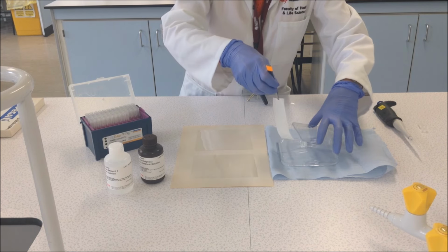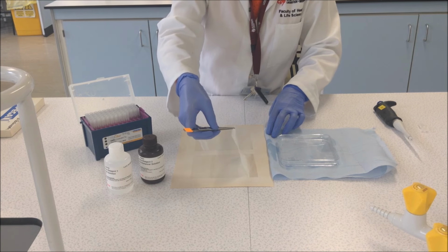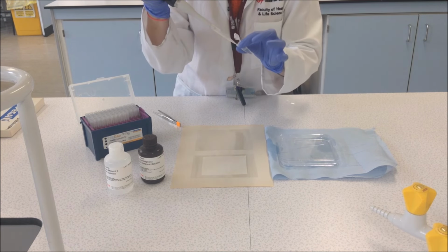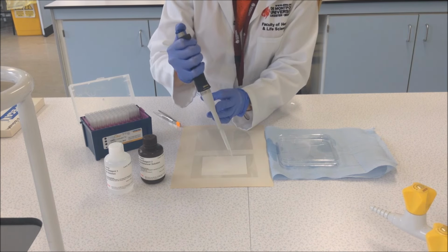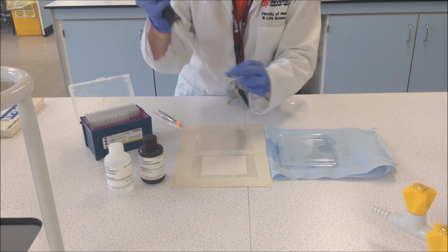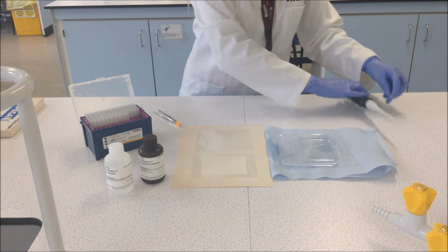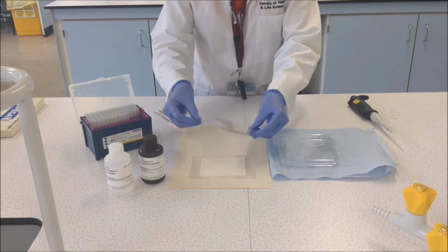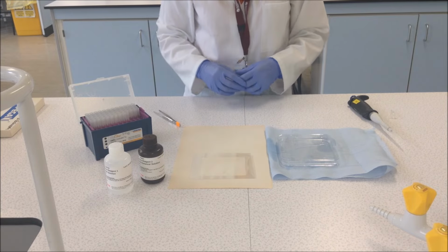What you then want to do is take your nitrocellulose membrane and place it onto a sheet of acetate. Then, using the solution of the combined detection reagents, carefully inject a layer of this over your nitrocellulose membrane, making sure that there is an even coating. Once you have successfully done this, place the second layer of acetate on top of the membrane, again ensuring that there are no air bubbles trapped within.